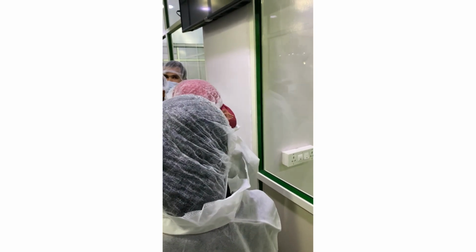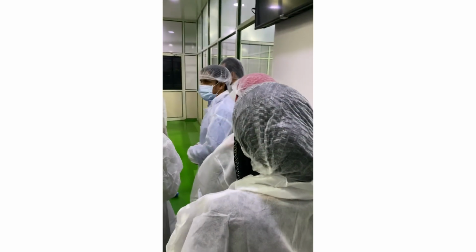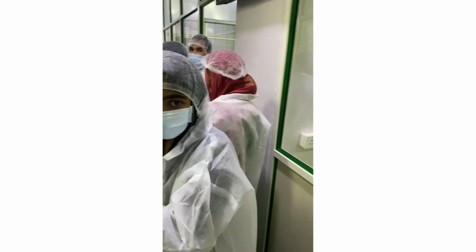Then it is sterilized, and there is a series of checks. Teams are there to check each and every step. 92 degrees. It is 92 degrees.